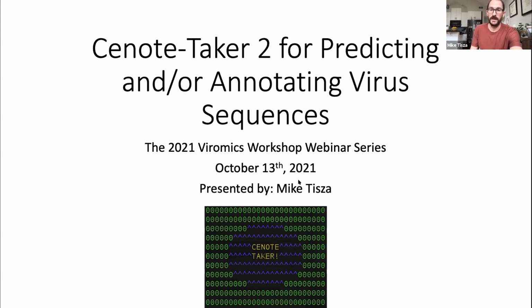My name is Mike Tisza. I am a postdoc at the NIAID in Bethesda, Maryland. I wrote Cenote-Taker2, this tool, during my PhD, but I continue to maintain and update it. So I hope it can be useful.